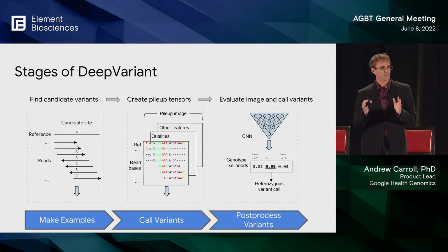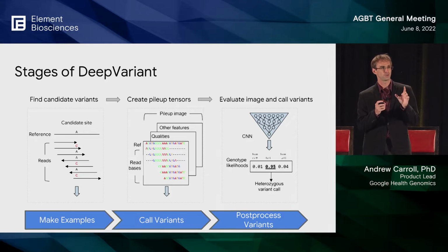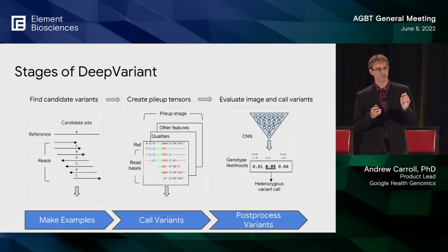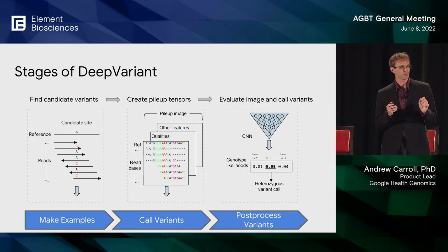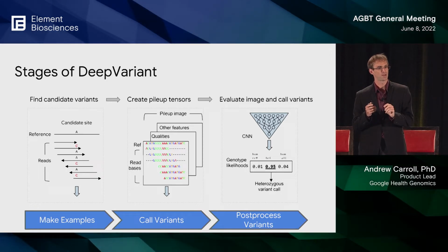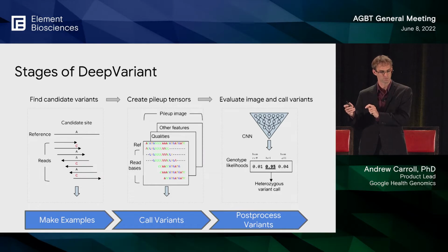There are a couple stages of DeepVariant. In the first component, there are human-written heuristics, which structure the input data and identify candidates. After those candidates are generated and annotated with things relevant for classification, a neural network looks into those pileups and creates a classification of these probabilities.